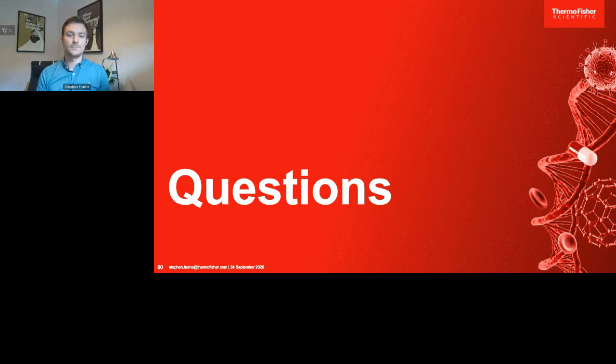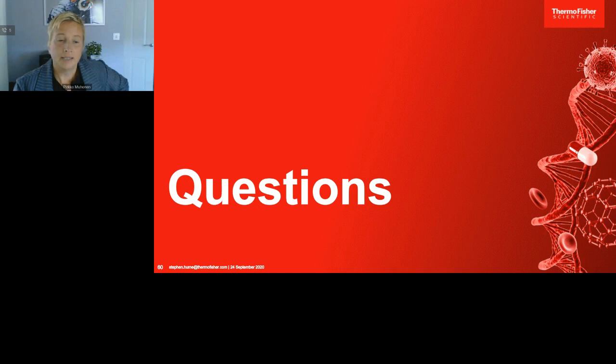Well, thank you, Stephen. That's a very good question. Yes, we do recommend mixing peptones so that it increases the diversity of the nutrients in the mixture, and you can really fine tune then and find the best conditions for your culture. So yes, the answer is definitely yes.